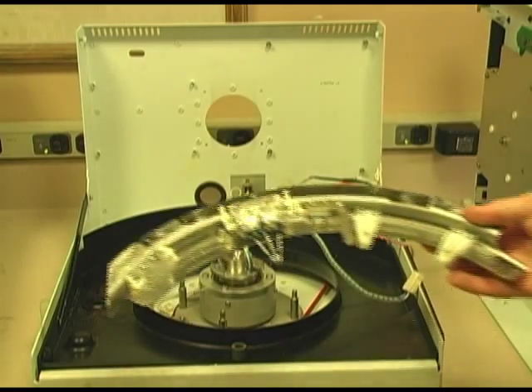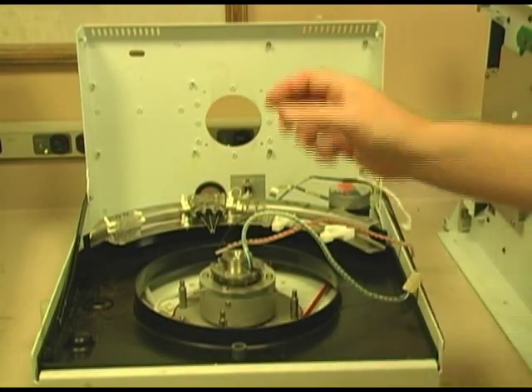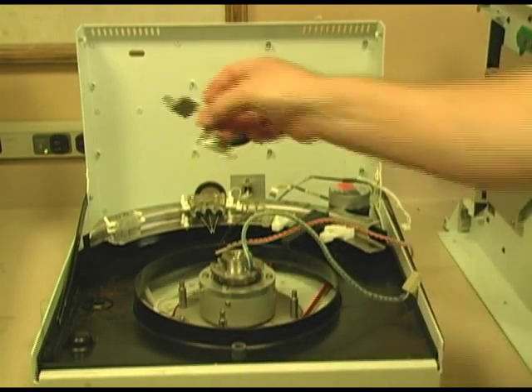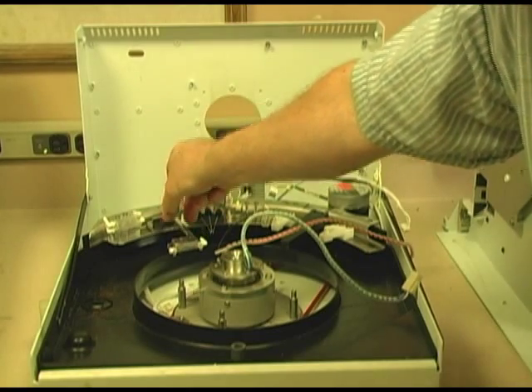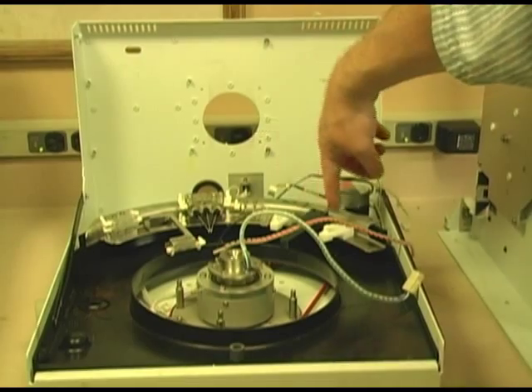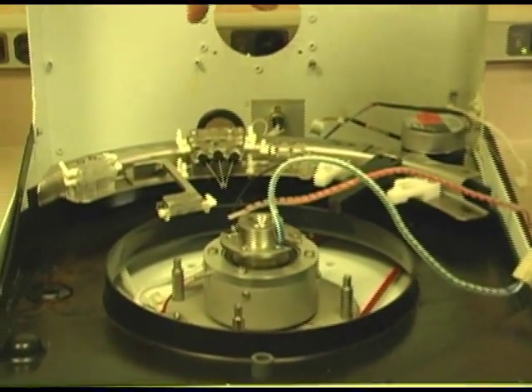Then you have all the little stations that sit in here in different spots. These are the stations to dispense your reagents and your cleaning and your mixing and all that. It's really kind of a neat unit.